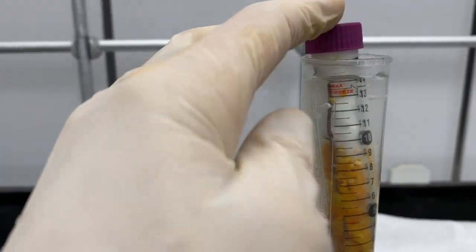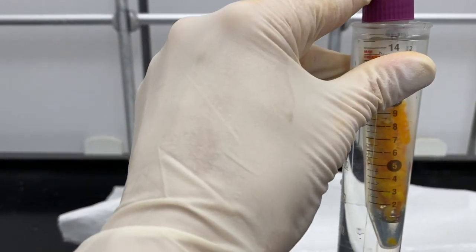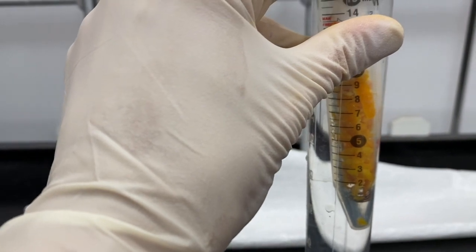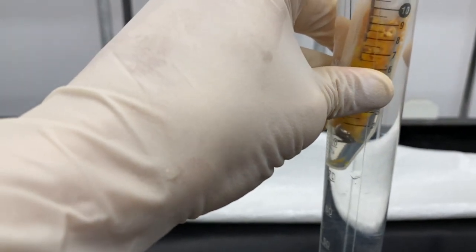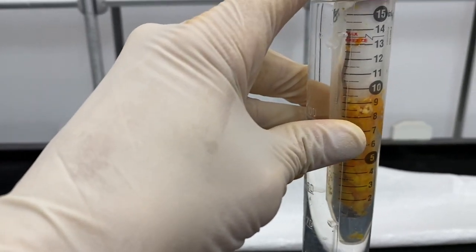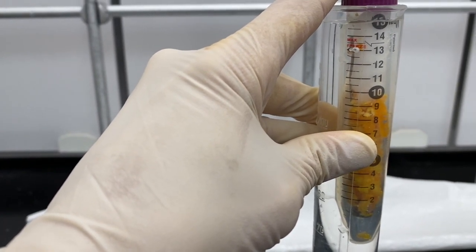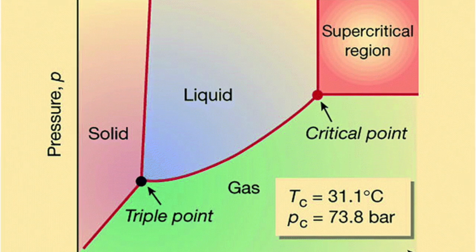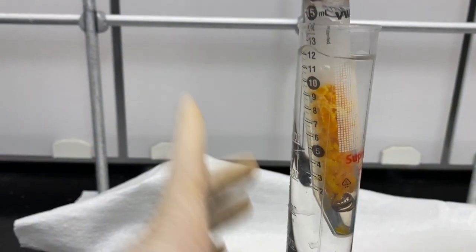Here we are on our third extraction. As you can see, all I'm doing is repacking the centrifuge tube each time with more dry ice. I'm extracting the same three-ish grams of orange rind. In between each extraction I'm replacing the water right before I put it in here, because I want to make sure that water is nice and warm. The more you increase the temperature of the water, that helps us access that pressure and leads us to get a successful extraction.